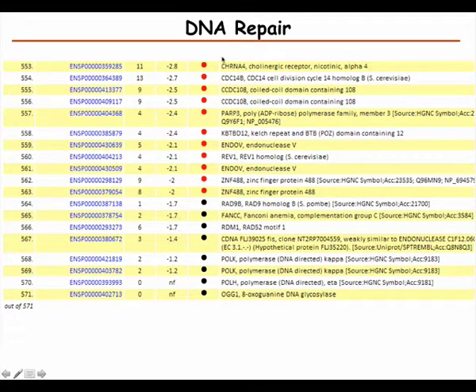And then at the bottom, there are lots of ones that have very borderline and probably not very strong evidence. And then we have a few cases where we don't observe anything. But you see that out of these 571 proteins, there are very few where there is no evidence at all, but quite a lot where there is sort of borderline evidence.